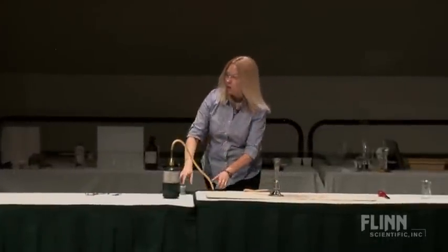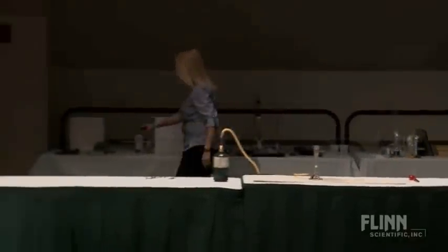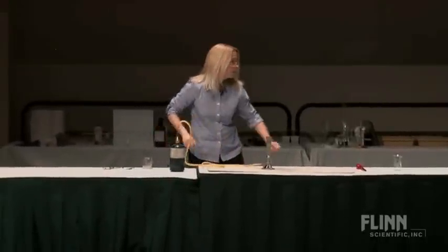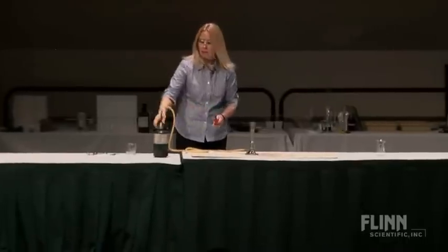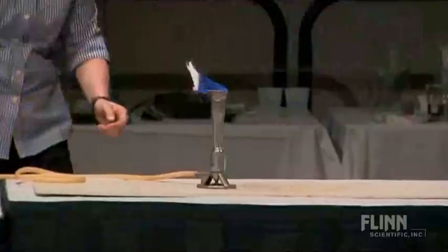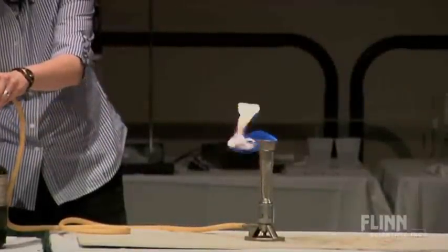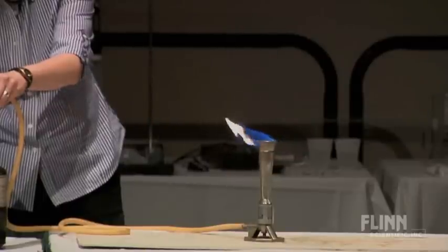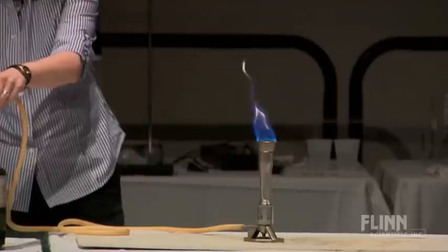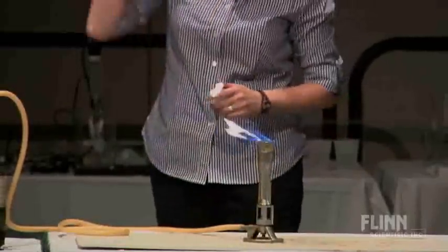So iron should be a fairly unreactive little metal. Let's get some iron out. I'm going to use this propane setup because it's a little less of a problem than the big tank. Light a burner. Turn it down just a wee bit. Now why do we have such a bright yellow flame? Because it's propane, not methane — it's bigger, and it takes more oxygen to feed it. So if we can dim the lights just a wee bit here.